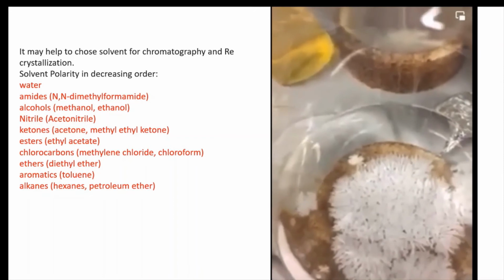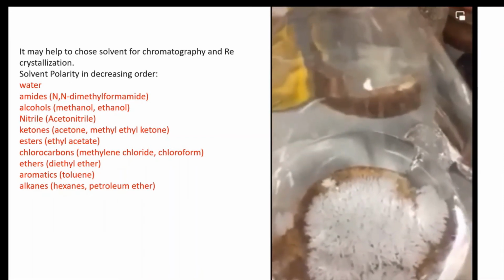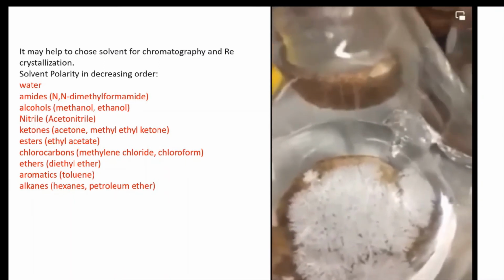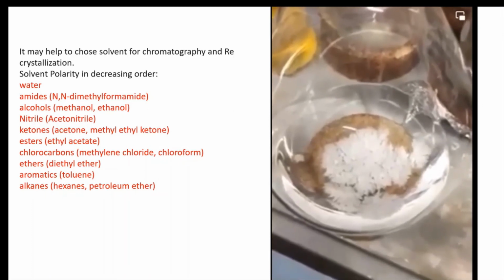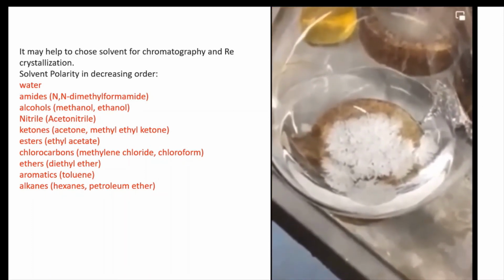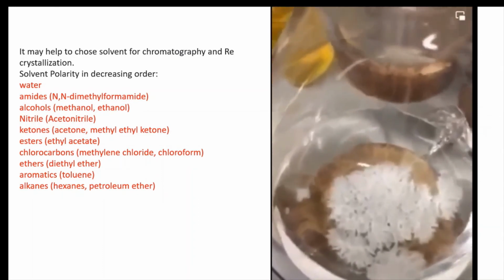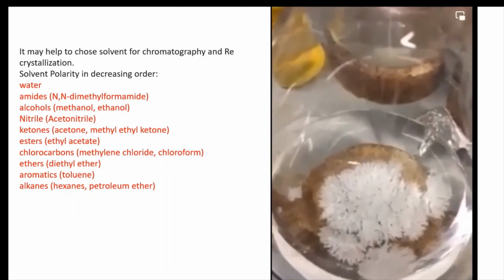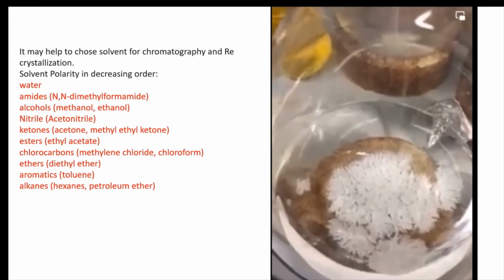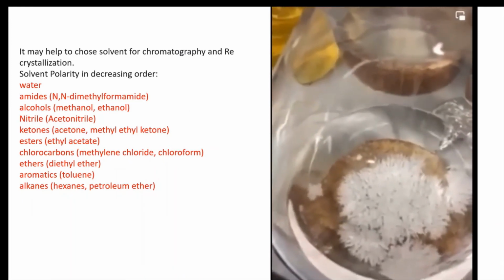If you see it is moving quickly with hexane, that means your compound is soluble in hexane. Then you can dissolve your compound in hexane, and interestingly, the residue from NBS, succinimide, doesn't dissolve in hexane. It will stay as a solid, so you can filter it out, and the liquid should have your compound.